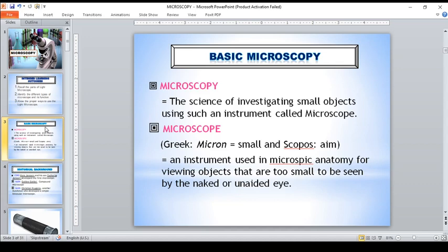And we have the process called gram staining wherein you will get a sample of the urine and put it in a slide, fix it, dry it, and then stain it. And again, what is the purpose of staining? 3, 2, 1. That is to provide contrast, to provide color to make them visible under the microscope.